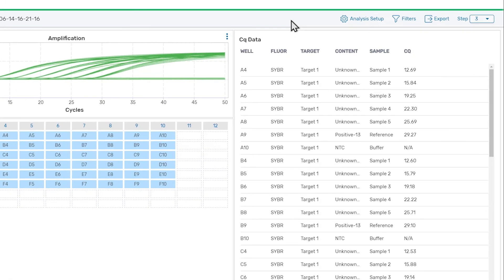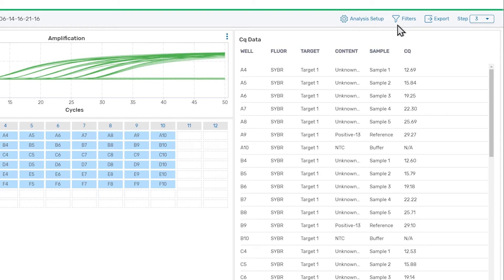There's a toolbar at the top of the page below the header. The toolbar is where we can access the analysis setup panel to adjust the analysis settings, such as threshold values. We can also access filters to hide or omit targets or fluorophores from analysis, export the amplification data to CSV format, and select which amplification step to analyze.